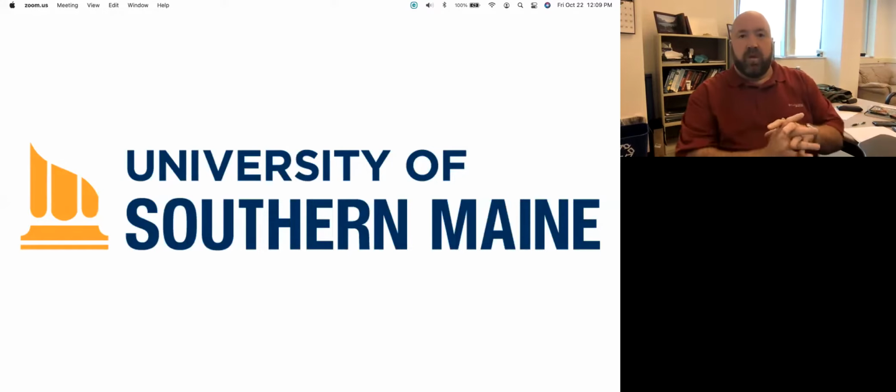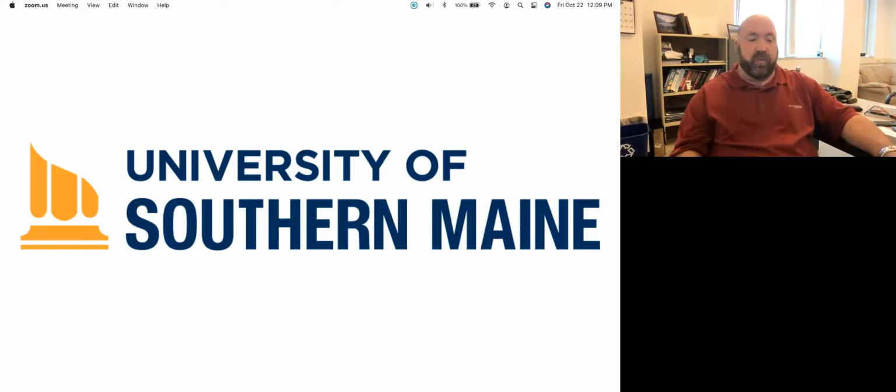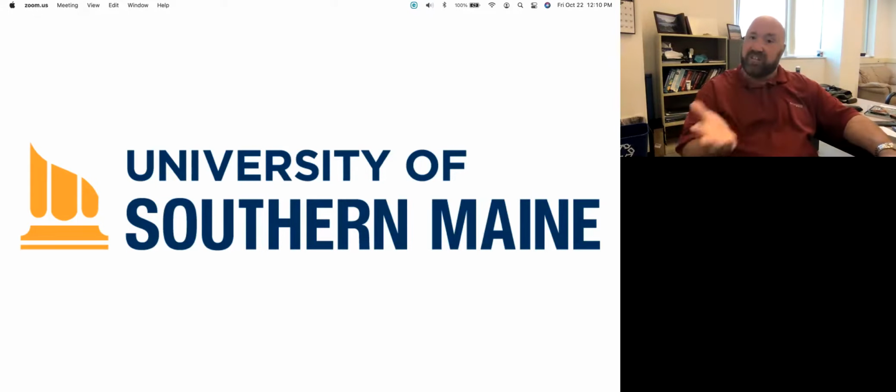Hi, everybody. So I wanted to record a video going over the pre-lab information for Module 4, Task 2. This way, you'll be able to just come to lab and get right to work without having to listen to me. And really, the big reason for that is because you're going to have to do a ton of titrations. You're titrating all of the Green River samples plus a standard, which we'll talk about. And you're going to need to do each of those at least 3 times.